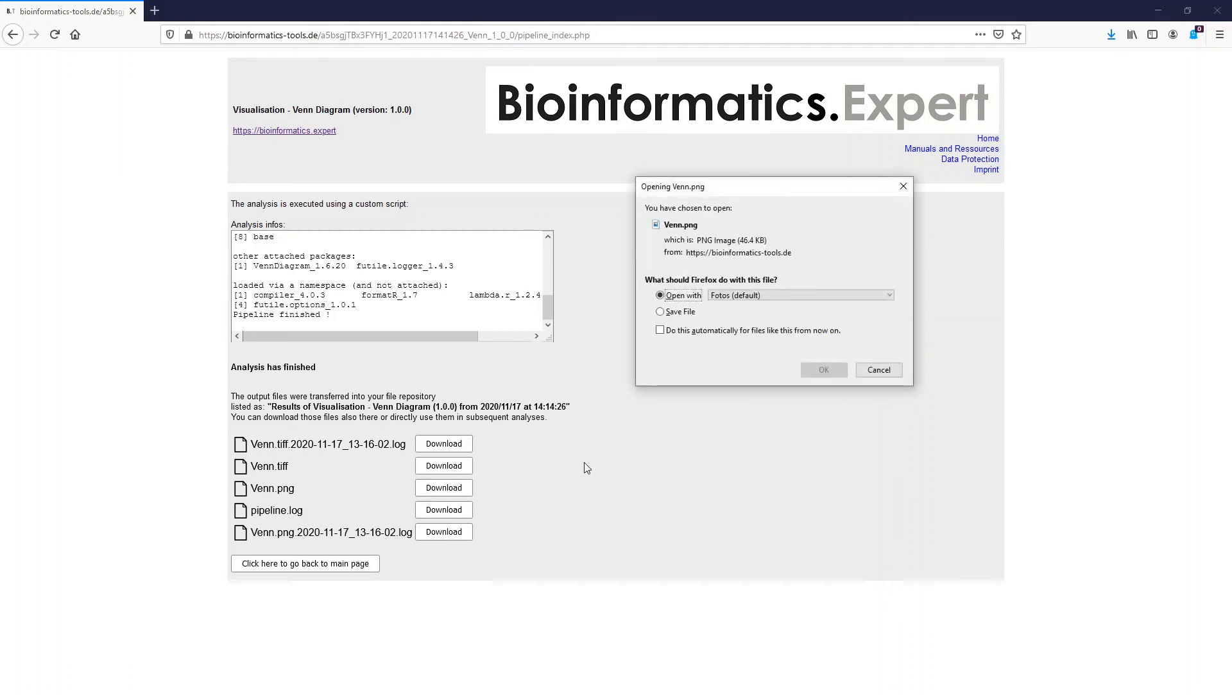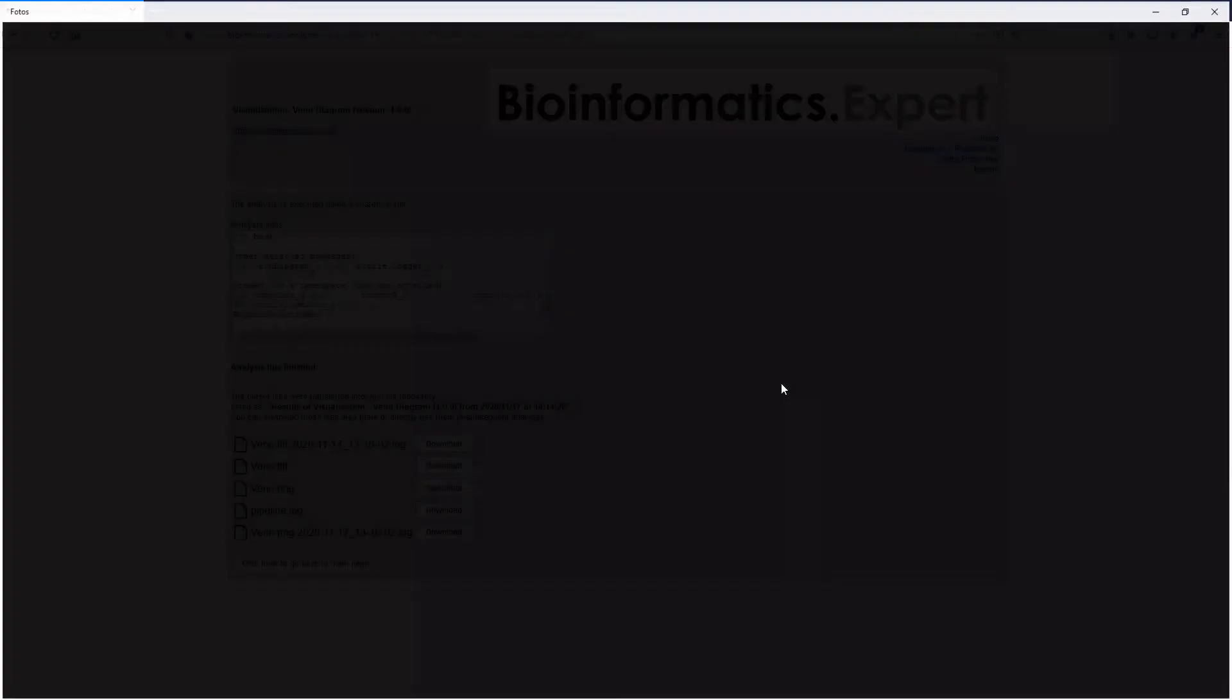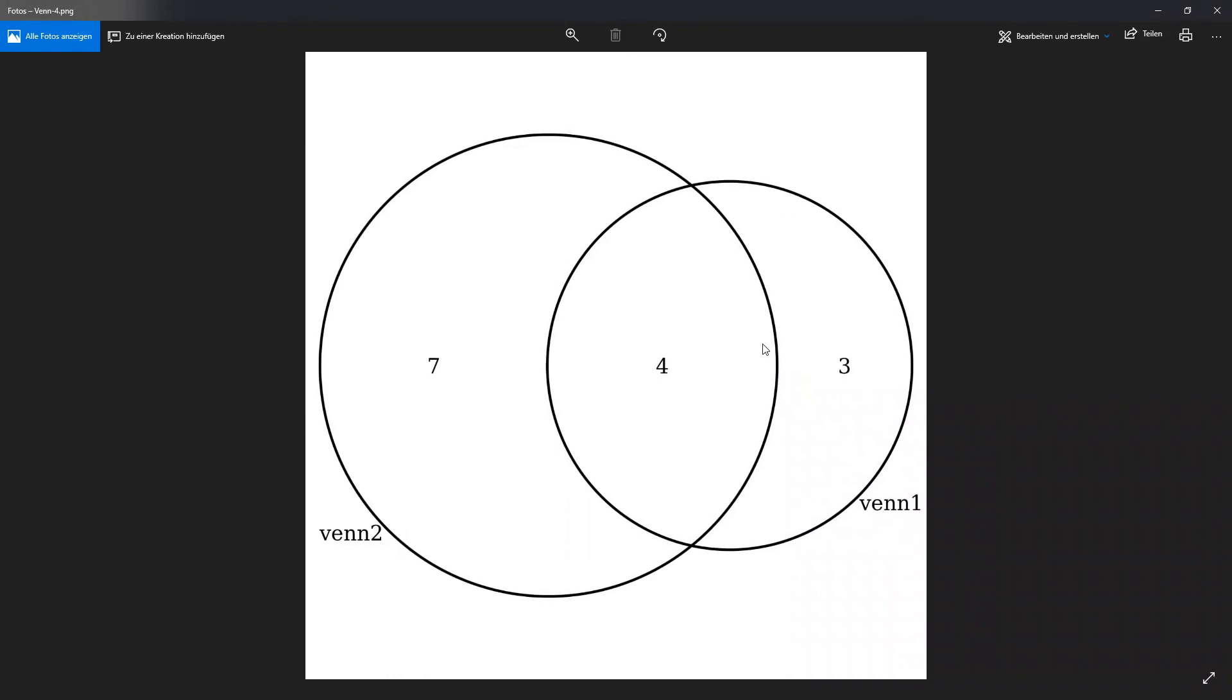When we open the output plot we see that four elements overlap in Venn 2 and Venn 1. Seven elements are unique to Venn 2 whereas three elements are unique to Venn 1.